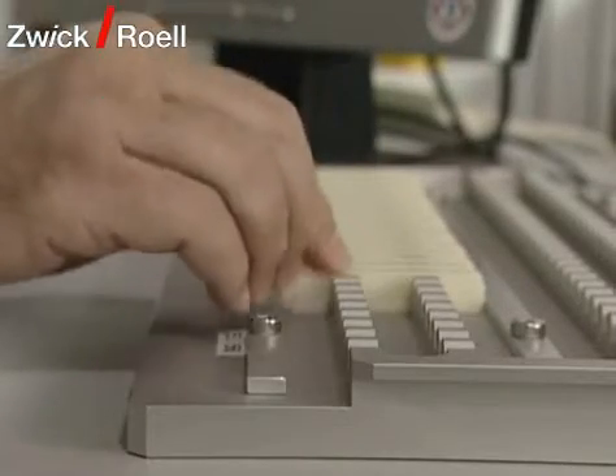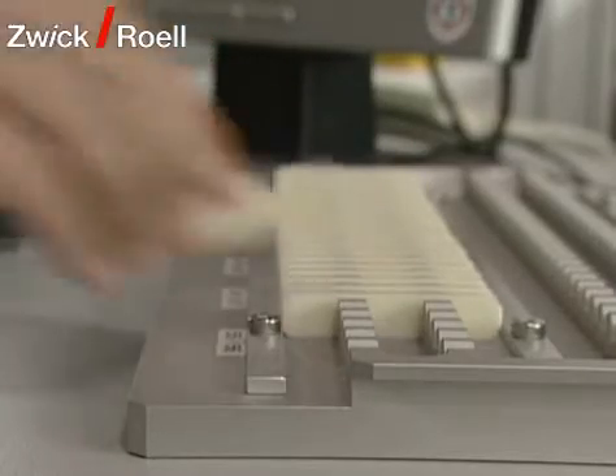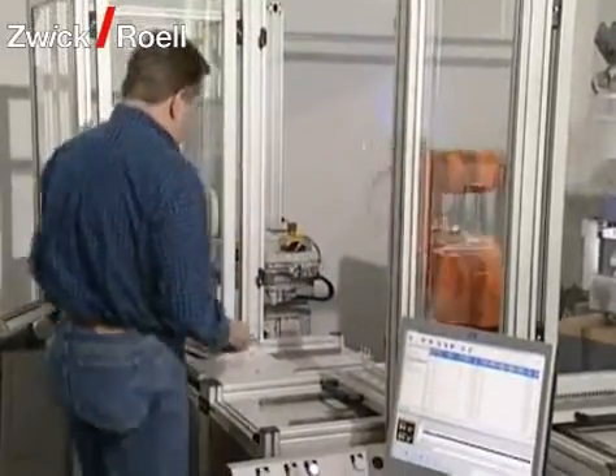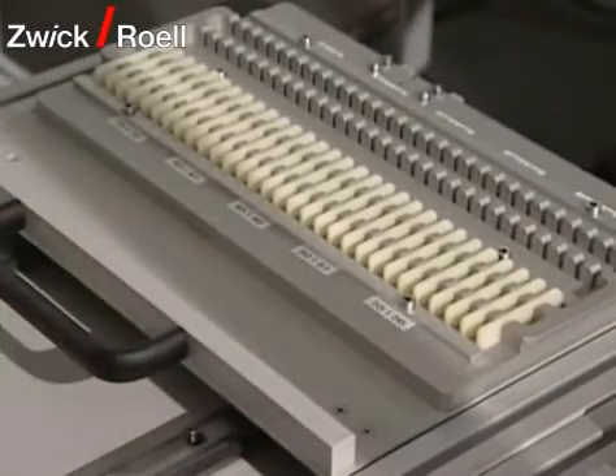The testing sequence is determined by the built-in pendulum and the required temperature in the temperature chamber. The specimen magazine is variable and can be adjusted to suit the requirements of the customer. The magazine in this machine offers space for a total of 180 specimens.